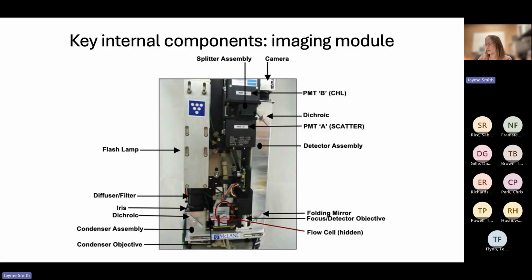A lot of these parts, not all of them, have the ability to make adjustments. They're motorized, with an automated motor-type assembly that you can control from home base when you talk to the instrument from a remote location, and then they have a manual option as well.